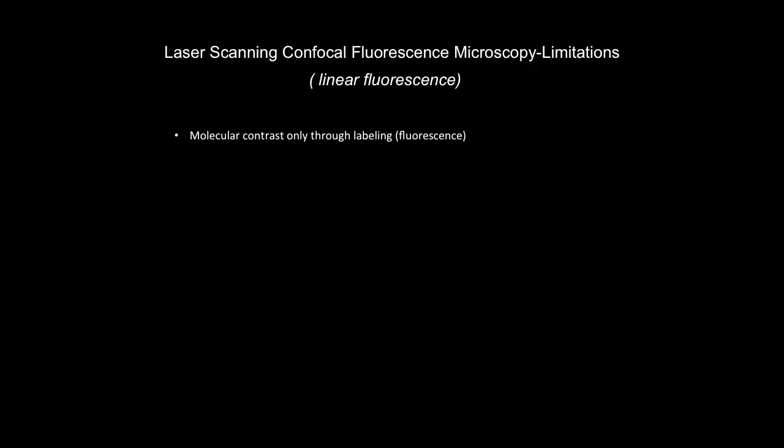So for the endogenous dyes, for these fluorophores that we have in the system and they are intrinsically fluorescent, you need to pump them harder to be able to get fluorescence, and this is when you get photo damage. If you use a longer wavelength for that, the likelihood is less, and we'll see that. Also this technique uses short excitation wavelength, and that provides limited penetration depth.